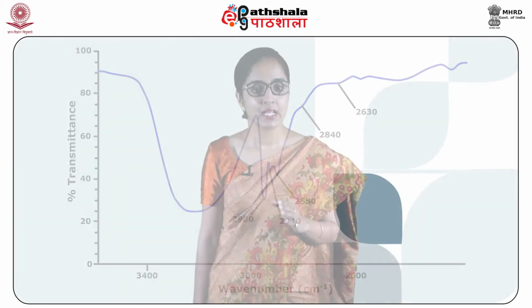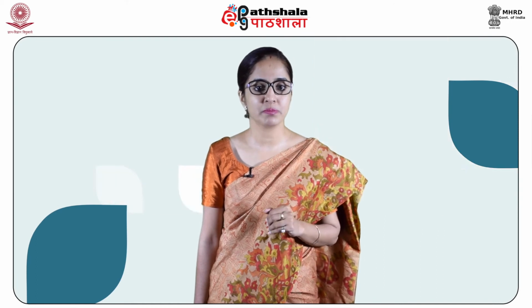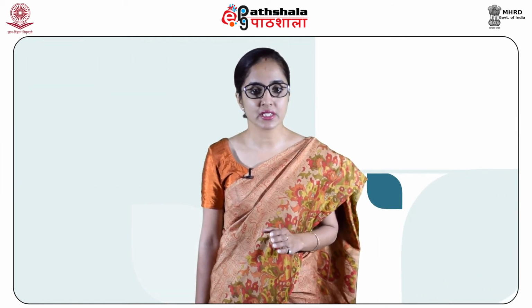also other than them. Next use of IR spectroscopy is in the identification of primary, secondary and tertiary amines. The primary amine, that is NH2, secondary amine NH, and the tertiary, that is no hydrogen attached to the nitrogen, amines may be differentiated by using infrared spectra.